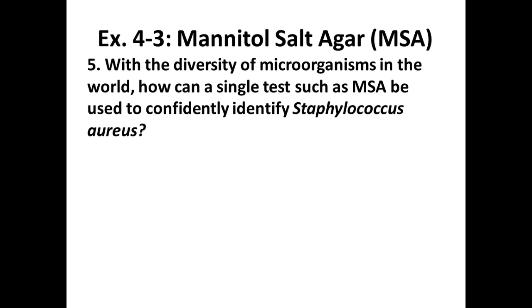So they got plenty of carbon and nitrogen. That's not an issue. That's not why they're not growing, right? They should grow. The problem is that high salt concentration. Now, could you do this single test?